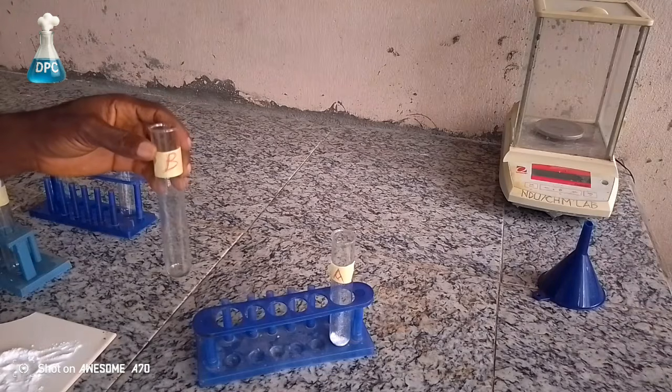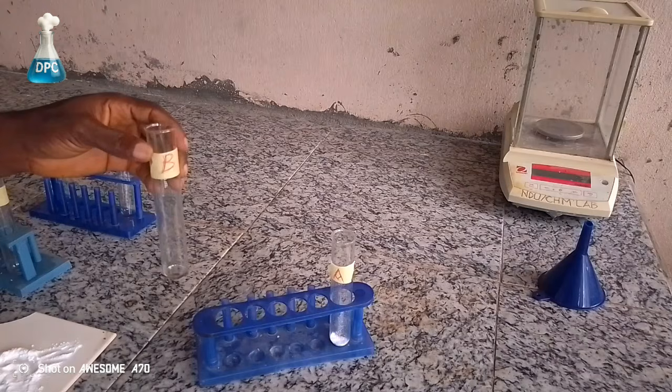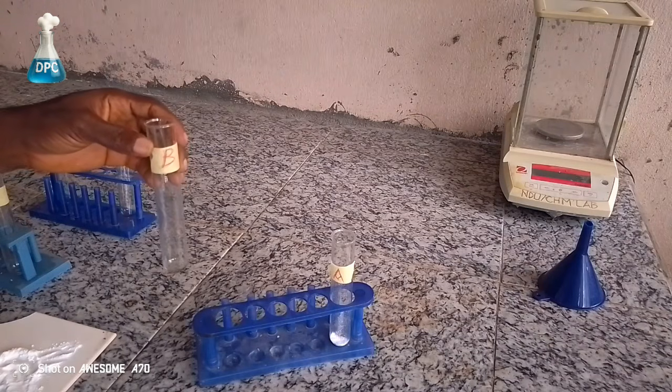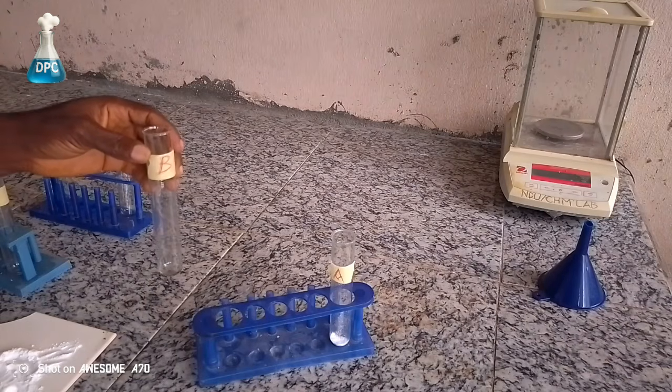Now we can put the sodium hydrogen carbonate in test tube B. Now test tube B is to just contain 1 spatula of sodium hydrogen carbonate, the same loading water level.